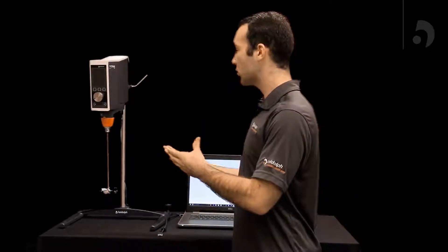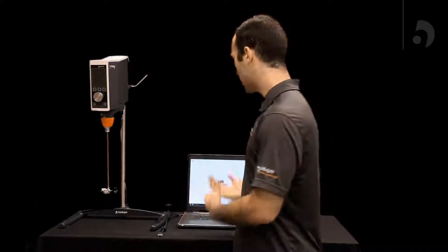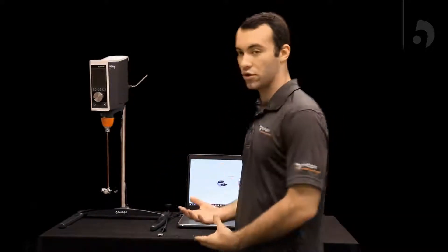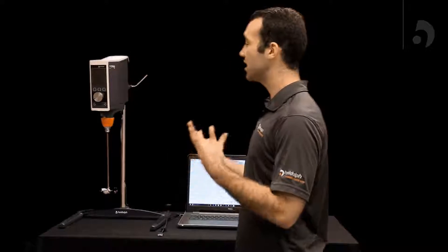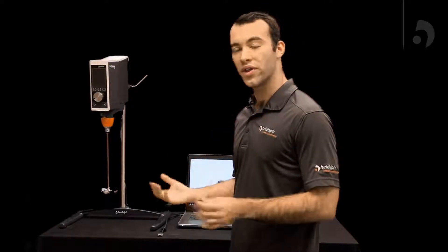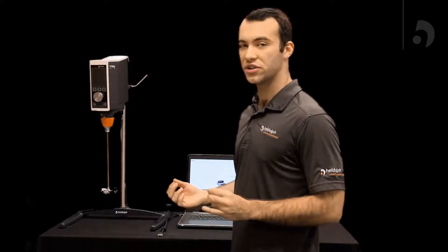They're compatible because they have a micro USB or mini RS-232 port in the back and that will plug into your computer. In our case we're going to be using the HiTorque 200 Precision with RS-232.